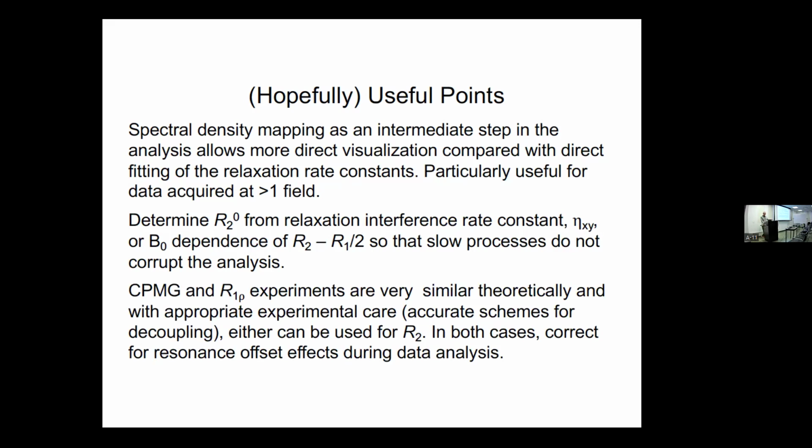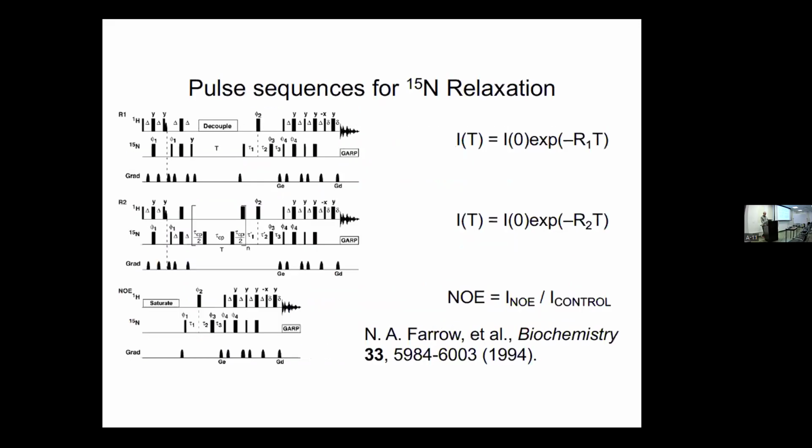Perhaps it doesn't need to be said that one should pay attention to resonance offset effects. And this gets worse and worse as you go to higher and higher field. So here are some classic sequences for measuring R1, R2, and NOE in solution. It's already 30 years since Neil Farrow and Lewis Kay published these.